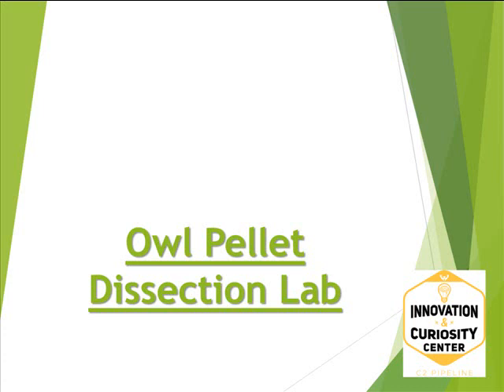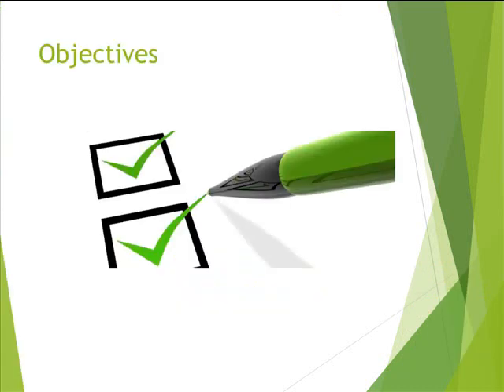Welcome to the C2 Pipeline Innovation and Curiosity Center Owl Pellet Dissection Lab. After completing this lab, you should be able to do the following: understand food chains and food webs, learn about barn owls and their pellets. You will also safely dissect a barn owl pellet.